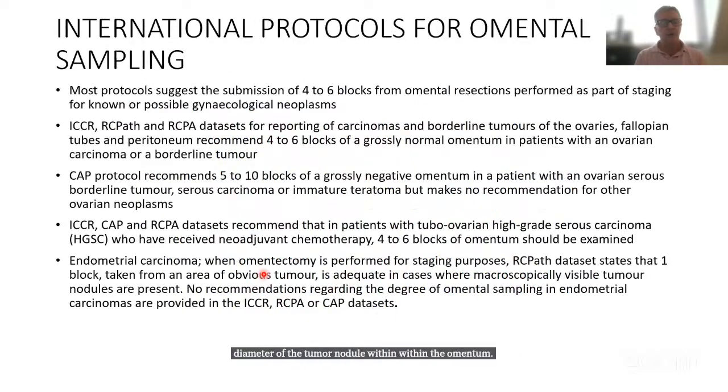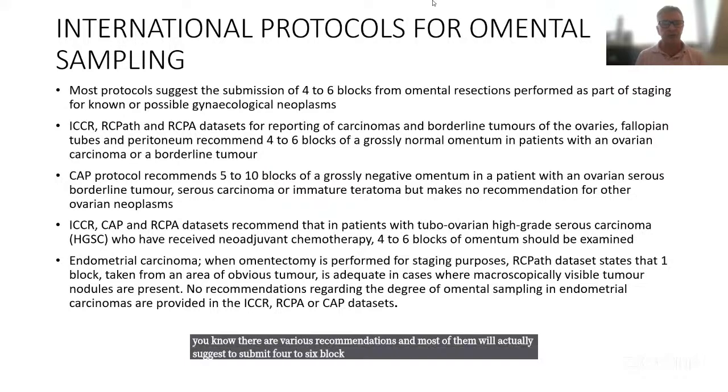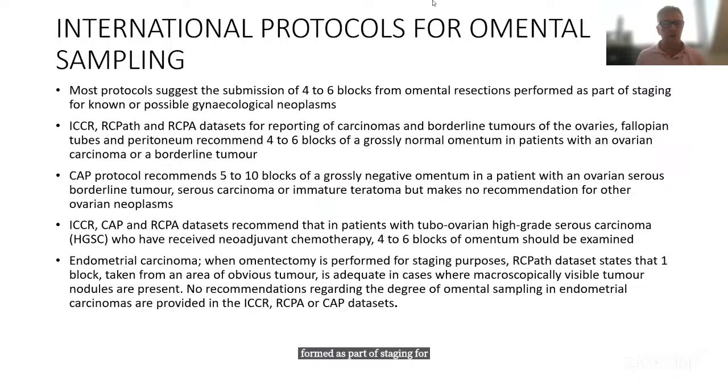Now, there are international protocols for omental sampling. There are various recommendations, and most of them will suggest submitting 4 to 6 blocks from omental resections performed as part of staging for known or possible gynecological neoplasms.